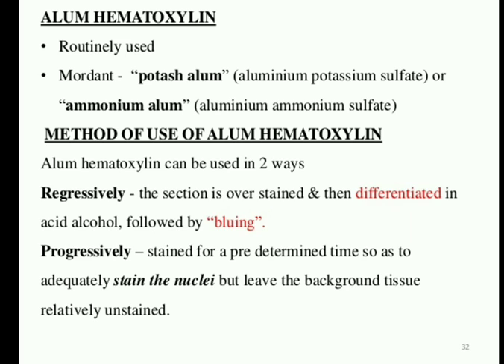In progressive staining, the sections are stained for a predetermined time so as to adequately stain the target while leaving the background tissue relatively unstained.